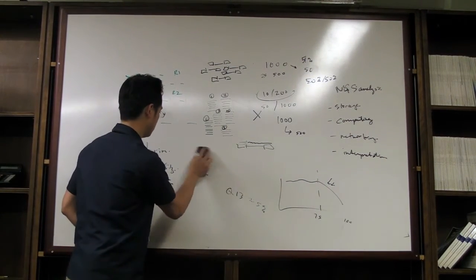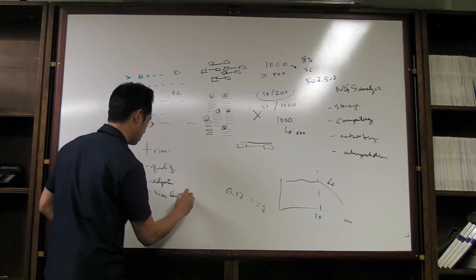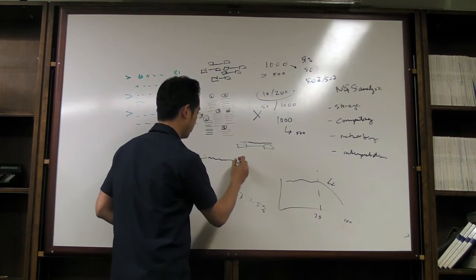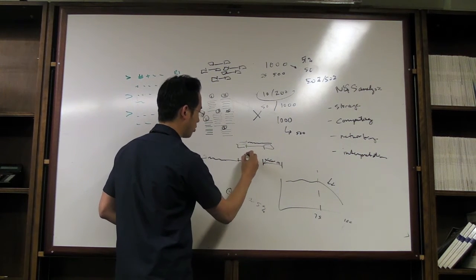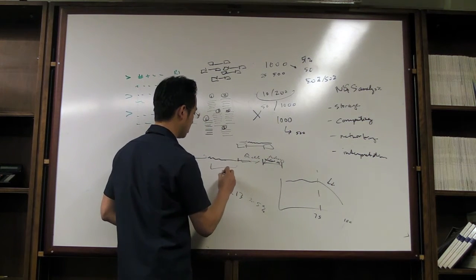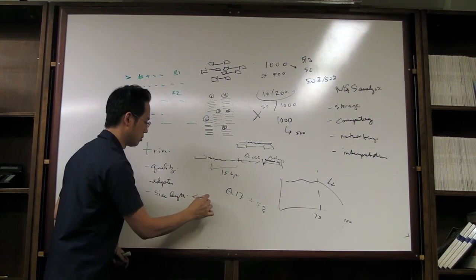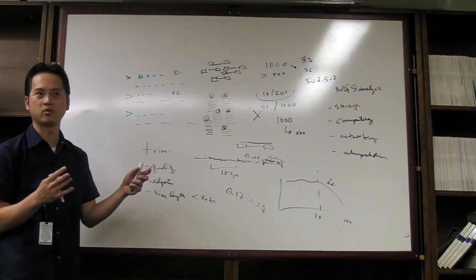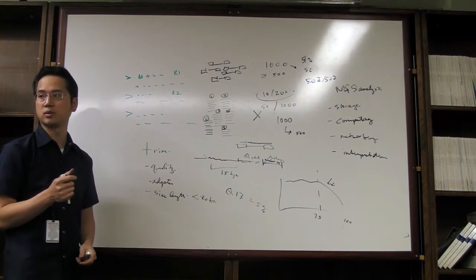And let's see. I'm going to do it by size or length. Let's say you do some sequencing and you get, after trimming and everything, right? After you trim for adapters, after you trim for quality, you end up with something that's like 15 bases in length. You've cut out so many things. Maybe I just want to get rid of everything that's less than 20 bases. So you can do it that way. Because when it's less than 20, it's going to start mapping everywhere in the genome. It's not unique enough and complex enough. So you want to do size trimming as well.